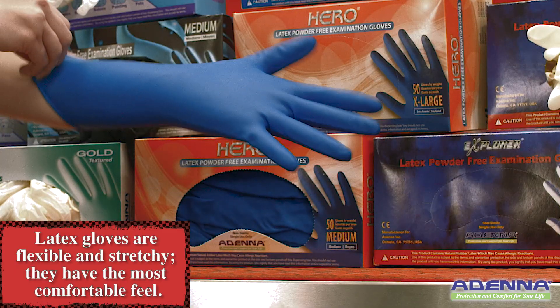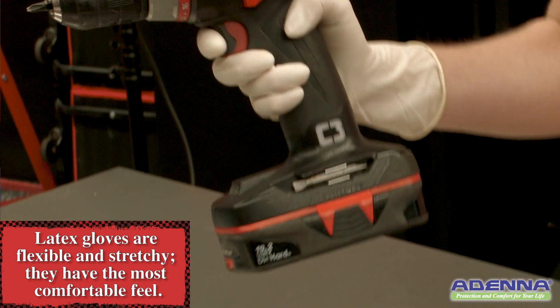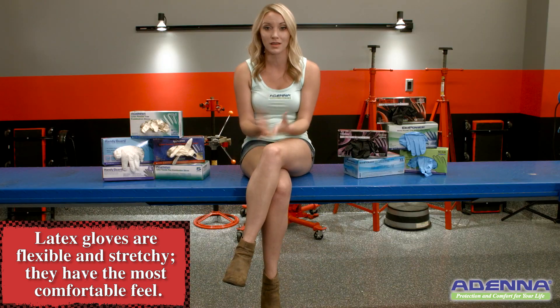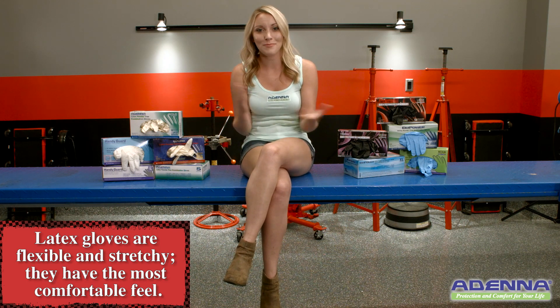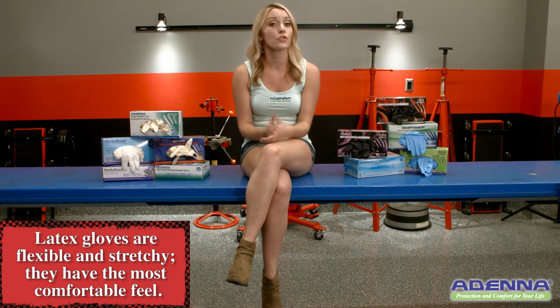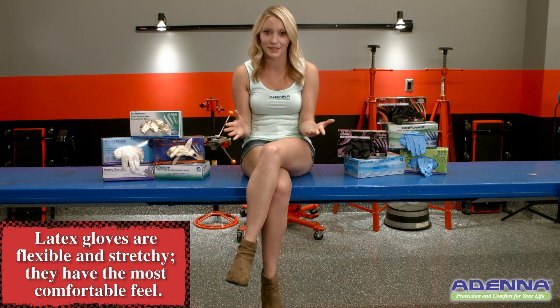Latex gloves are very flexible and stretchy, and they usually have the most comfortable feel. However, some people develop allergic reactions to the latex protein in these gloves — just like some people have allergic reactions to avocados, bananas, or peanuts. Rubber latex allergies can range from mild to very severe.